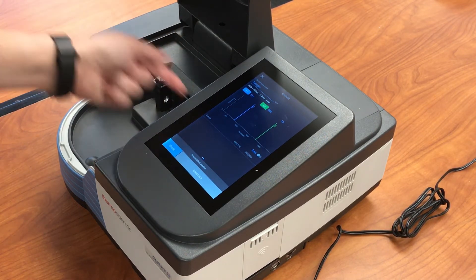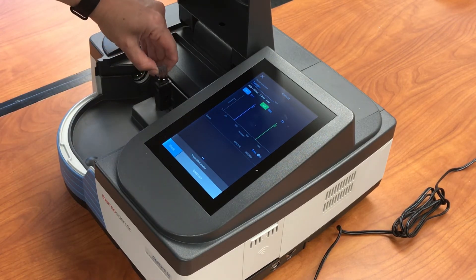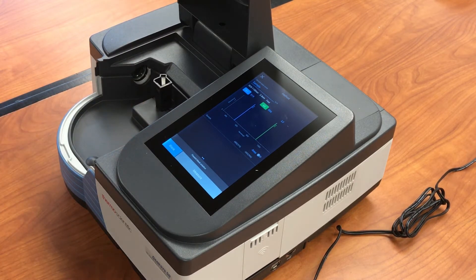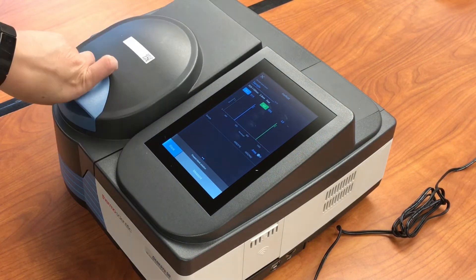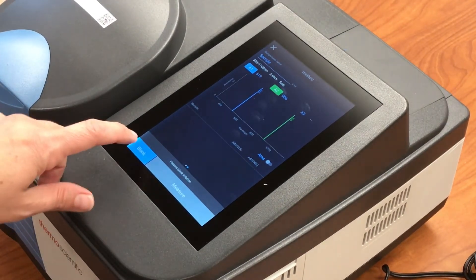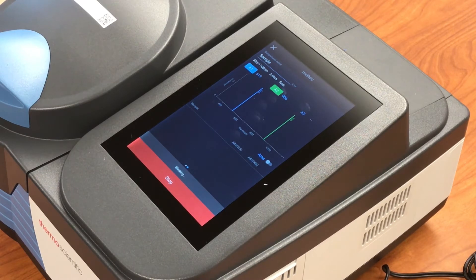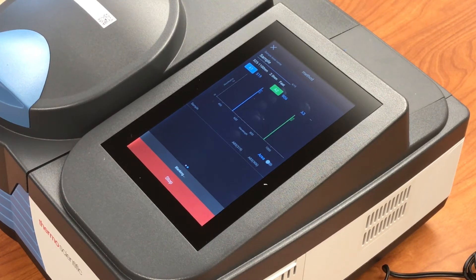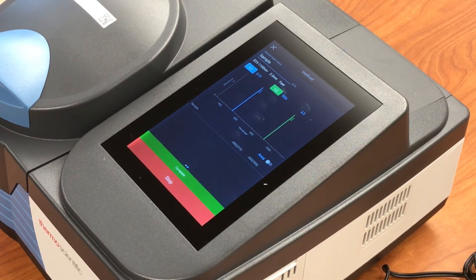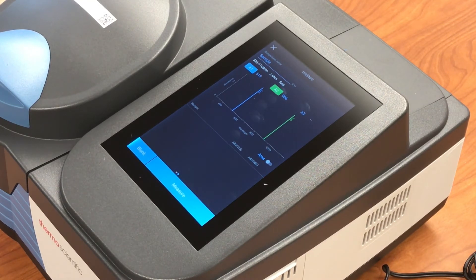The light passes through this direction, so make sure that you are putting the cuvettes in here the correct way. Some of the cuvettes are marked so that light only passes through one direction. Then to measure the blank, you touch blank. You'll see that the instrument says blanking. If for some reason you needed to stop the measurement, you could click stop, but it will finish on its own and then tell you that it's complete. The blank has been measured.